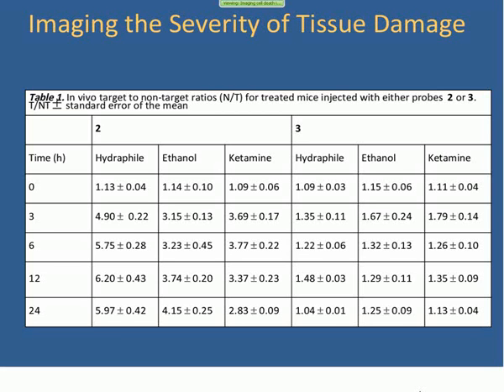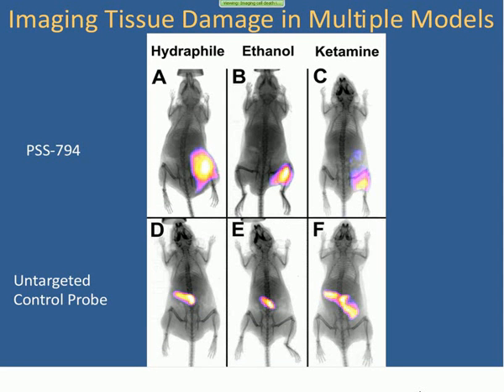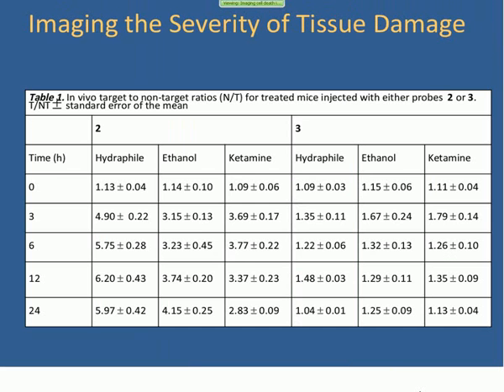So, one thing I'd like to show during these types of talks is how do you perform quantitative measurements when you're using an optical modality like fluorescence? And the answer is that you use ratiometric imaging. And what that means is you will calculate such things as target to non-target ratio. So here we'll get full intensity of the target region divided by the non-target. So this is a ratiometric way to elucidate the relative amount of probe that was involved in each of these sites.